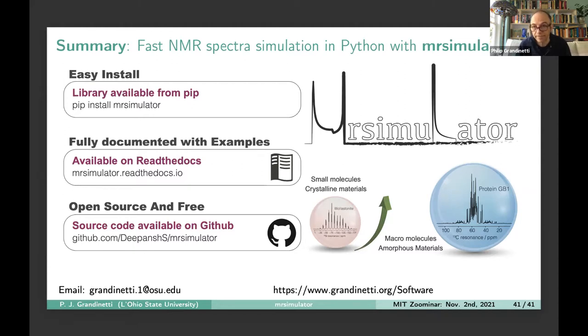Okay. All right. There's another question here from Jeff. He says, gorgeous. And what about hyperfine interactions with our favorite electrons? I wouldn't say it's not possible, but we haven't really done that. Maybe in a later version we can entertain that, or maybe even better, somebody in your lab might want to become a participant in the project and try to figure out what we need to add those kinds of capabilities. Yeah, and there are DNP experiments you could try to add to your system too.